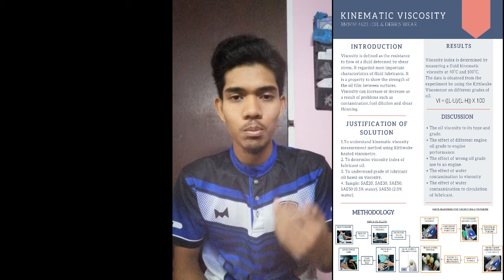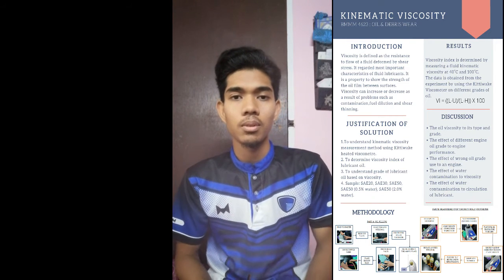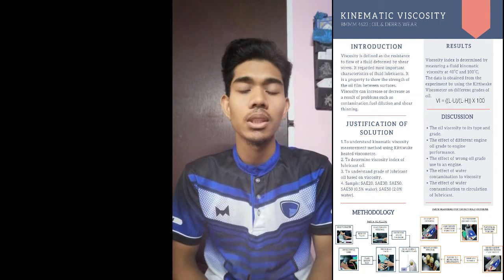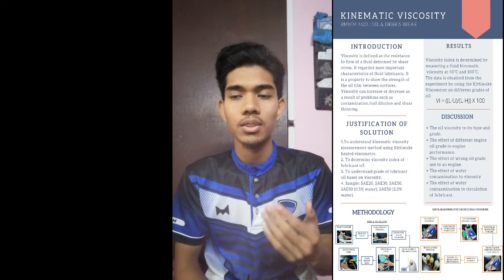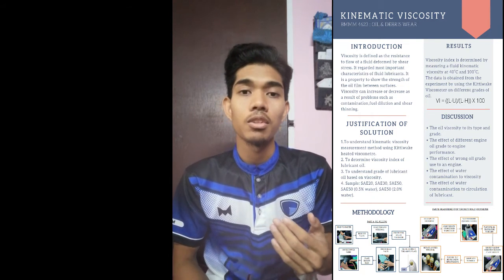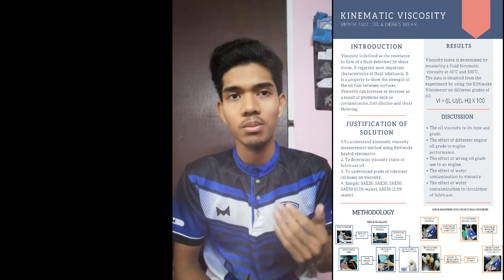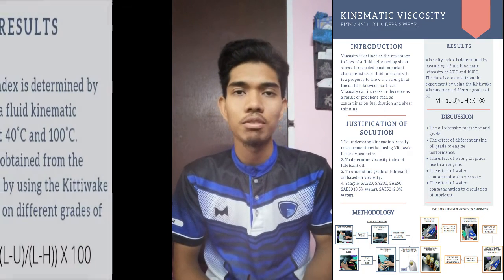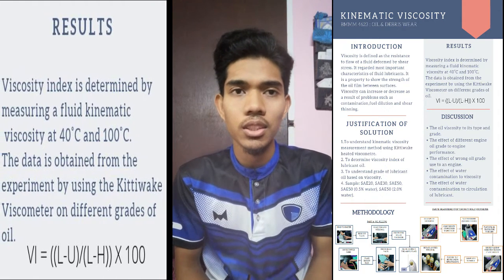For my part, I will be explaining the result and the discussion. First, let's go to the result. For the result, we will determine the viscosity index. The viscosity index is determined by measuring a fluid's kinematic viscosity at 40 degrees Celsius and 100 degrees Celsius.